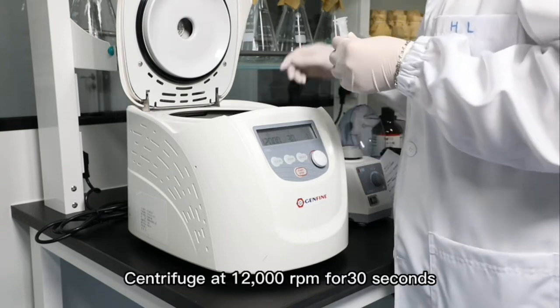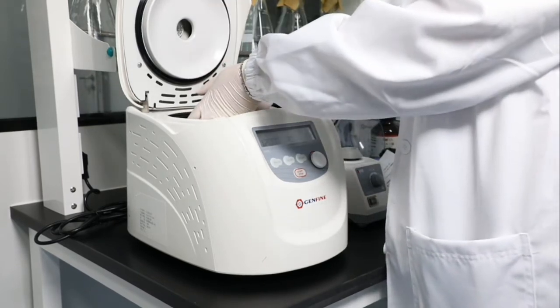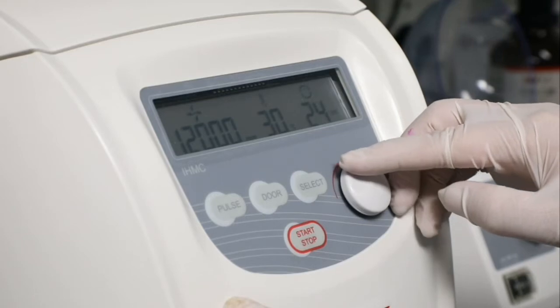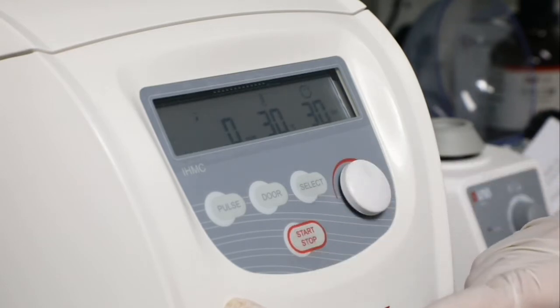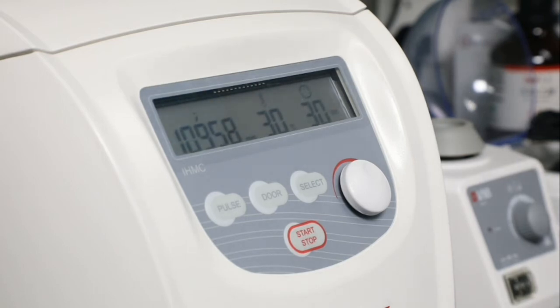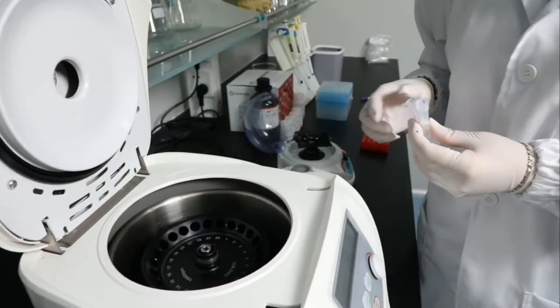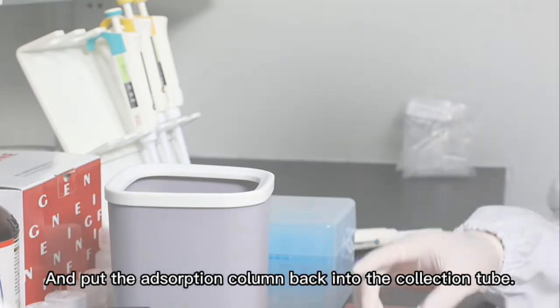Centrifuge at 12,000 rpm for 30 seconds. Discard the flow-through, and put the adsorption column back into the collection tube.